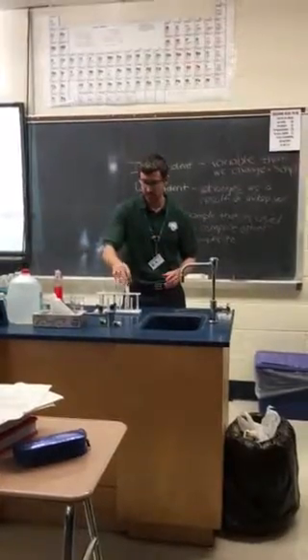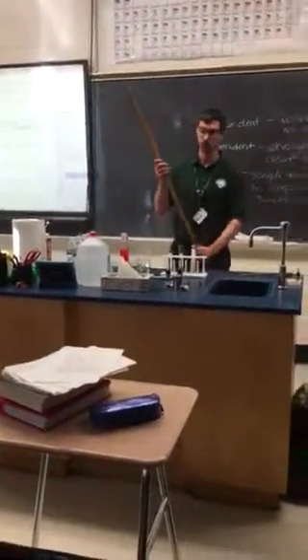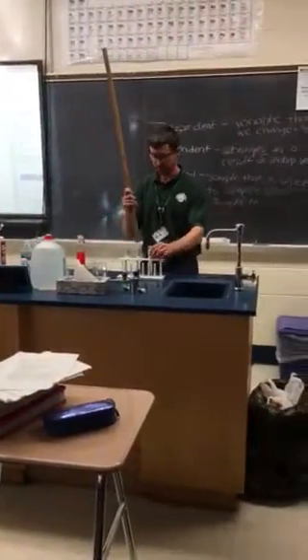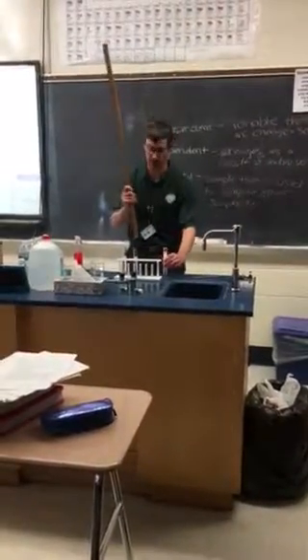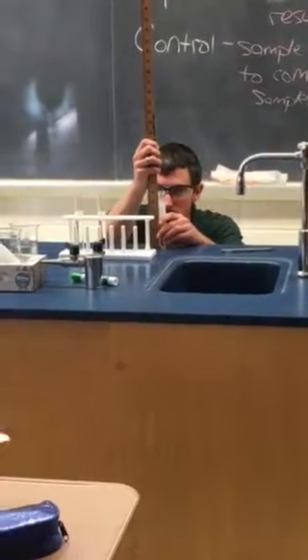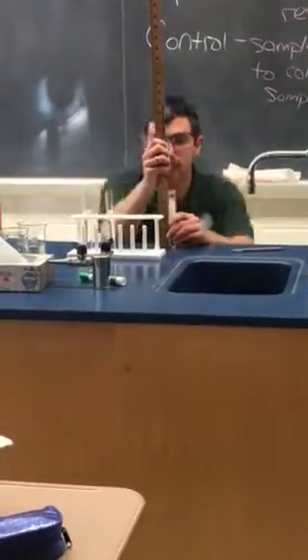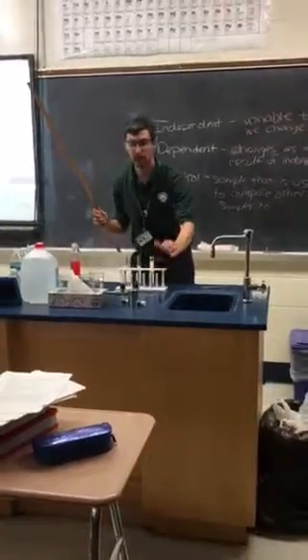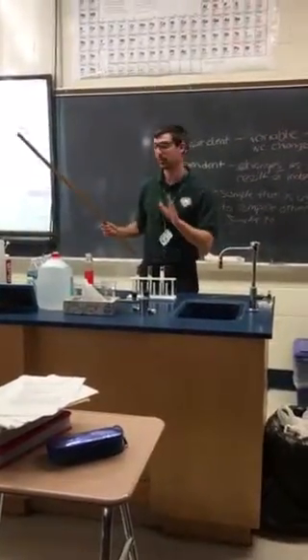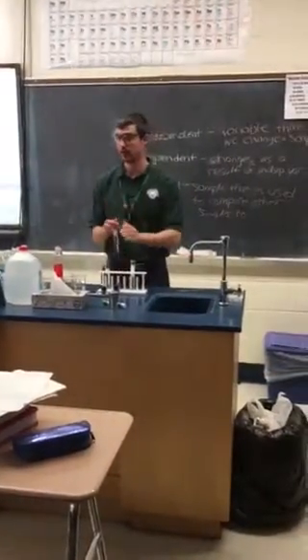So immediately after shaking, you want to use some type of measuring tool. This is a little large, but to see at what height the suds are. And so this is 5 centimeters, so you just want to record that, so you're going to record immediately after shaking and then 2 minutes later. And so while you're doing the one, another of your group mates can be doing another one, shaking. So the first one was the town water, the second one is the control.